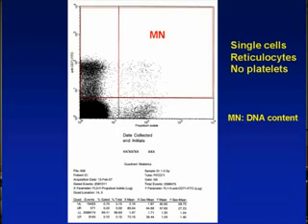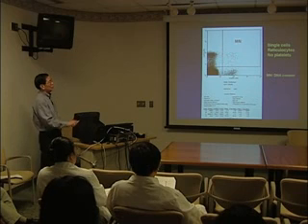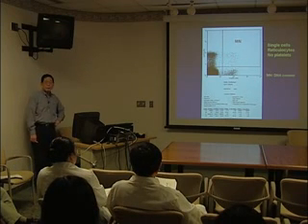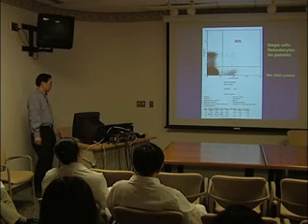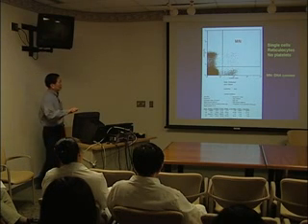For this particular sample, the mouse blood was irradiated, actually the animal was irradiated with 1 gray gamma ray, and you get the percentage of micronucleated reticulocytes about 2.5%. Okay, and later on I'm going to show you the one without any radiation. Then you can see a significant difference between the irradiated and non-irradiated percentage of micronuclei.